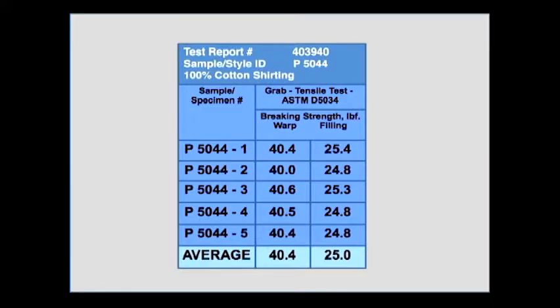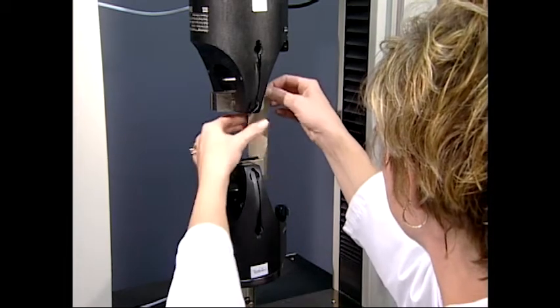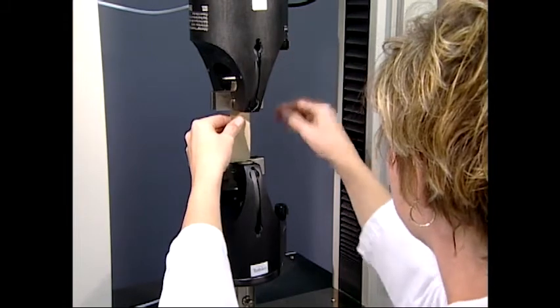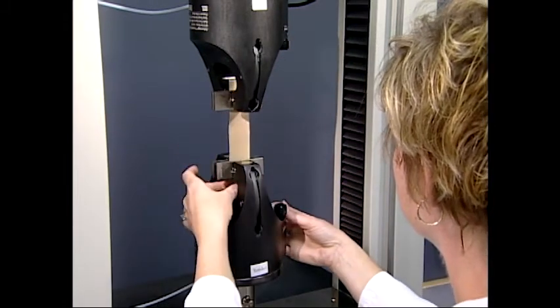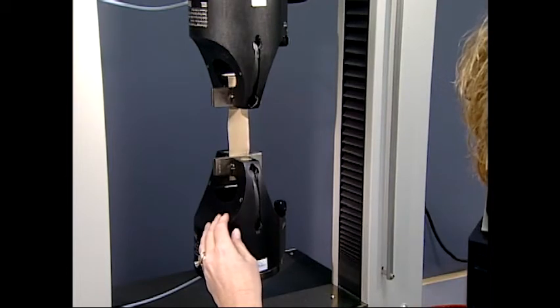Reporting of the data should include the test method chosen, the material description, the sampling method, the average breaking force for each testing condition, the average percent breaking elongation, and the testing conditions as related to temperature and relative humidity in the laboratory. The standards allow for strips of fabric that exactly match the width of the jaws to be tested. Two techniques are used, one the ravel strip and the other the cut strip method.